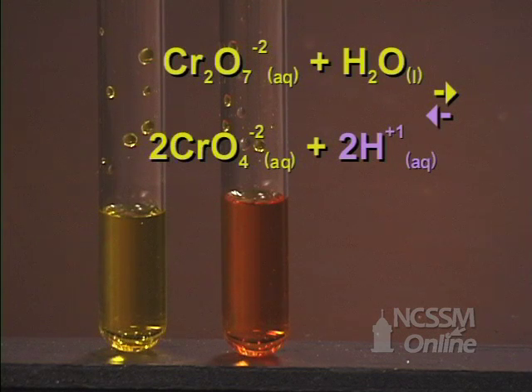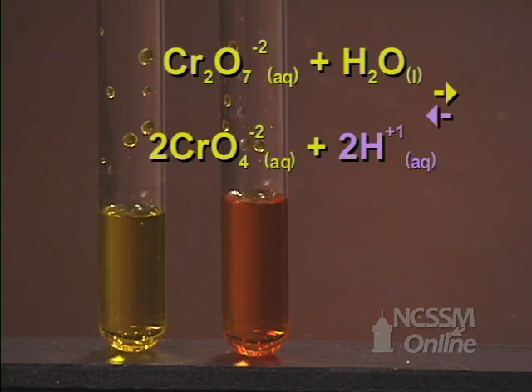The nitric acid provides a source of hydrogen ion. The reaction shifts in the reverse direction to try and use up the hydrogen ions that have been added.